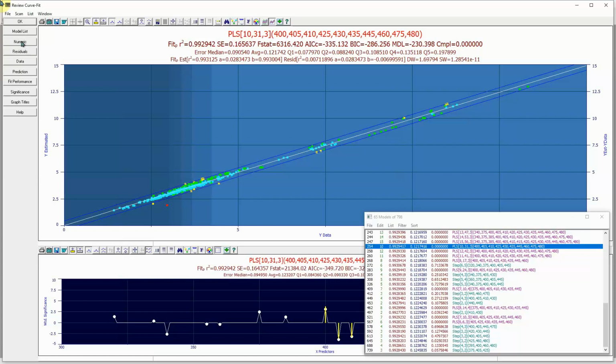In PLS and PCR, there's a positive or negative contribution from every wavelength made available to the modeling. PLS and PCR models will have a separate parameter for every wavelength in the modeling, meaning there will be some influence at every wavelength, although for certain wavelengths this may be small. Some of those wavelengths will apply to spectral components that have nothing directly to do with the component or components being modeled. They may be inversely related, perhaps a hydrophobicity, hydrophilicity, or moisture effect, or these wavelengths may be in the model simply from random chance and correlations.